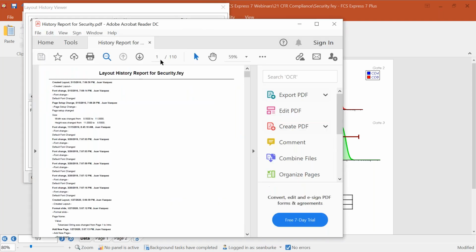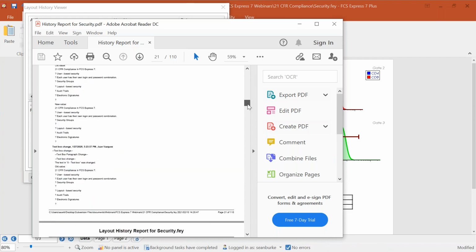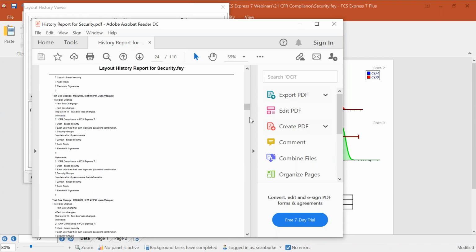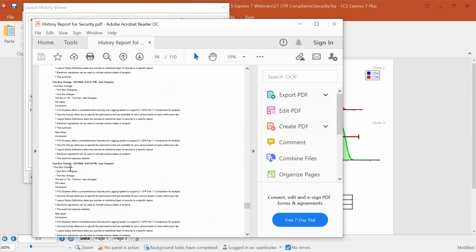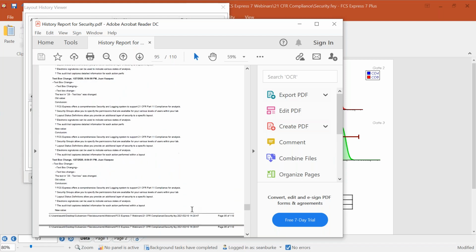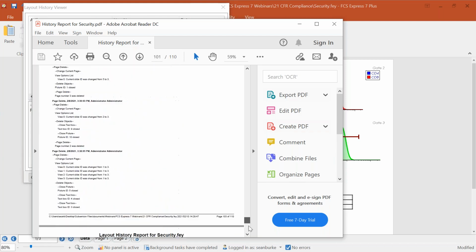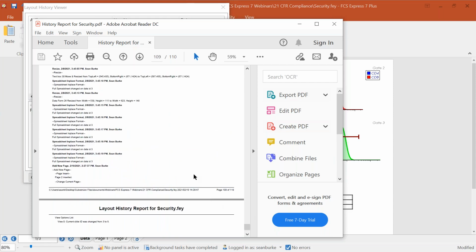And again, you can see, right, we've been doing this since 2016, so it's 110 pages. I hope your audit trails don't have to be that detailed, but they can be if they need to be. But this is what that audit trail looks like, right? It's going to show us, going back as far as the information we have, dates, times, who did these things, what they did, the steps that they did them. And that way you have all of this in either electronic format, or again, if you want to print, you can have that in a printable hard copy format as well.